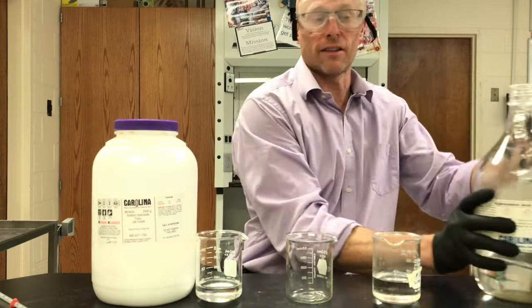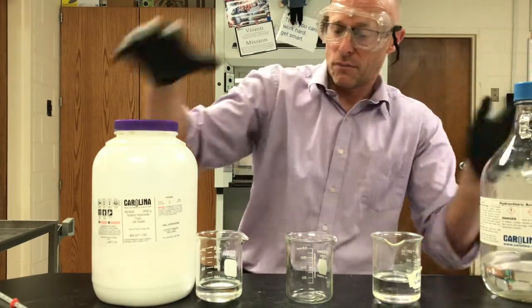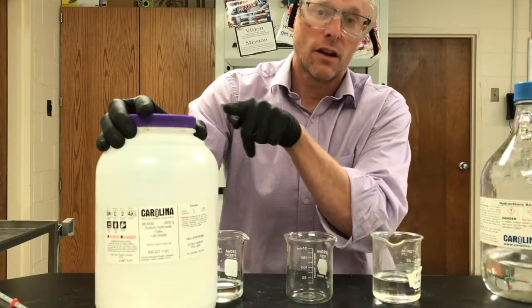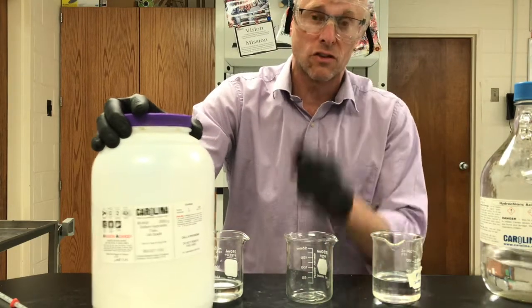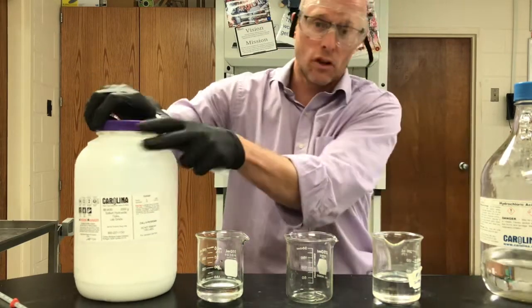It's very volatile — the vapors are very strong and you don't want to breathe these in. Over here I've got sodium hydroxide, which is a very strong base. I'm going to make a very super concentrated solution of sodium hydroxide.